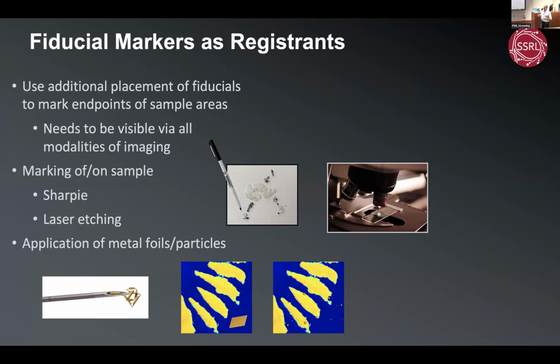And so we said, there have been years where we've all talked in various user groups about how we can make fiducial markers. And there's a lot of effort I think we have put into this at one point. Some people come in with Sharpies. I mean, that's actually a really good fiducial marker when it comes down to it, because I can see it. I can see it in the X-rays. But it's kind of crude, we'll say, right?